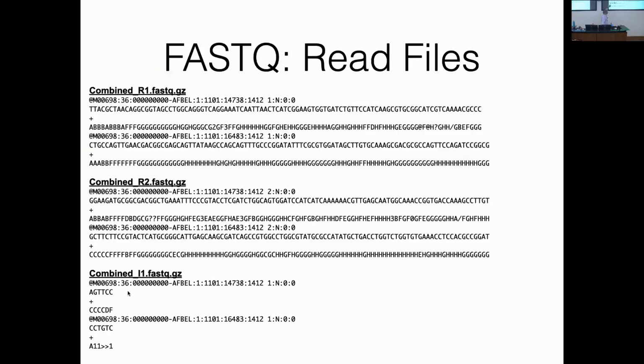So this barcode goes with that read and that read. This is the forward read, this is the reverse read, both from the same spot. And just in case you don't believe me, you can see that that's true because if you look at the coordinates for these reads, they're all the same because they all came from the same spot on the flow cell.